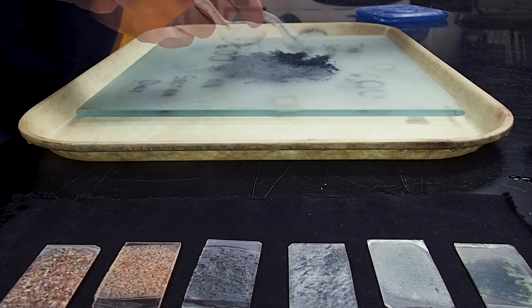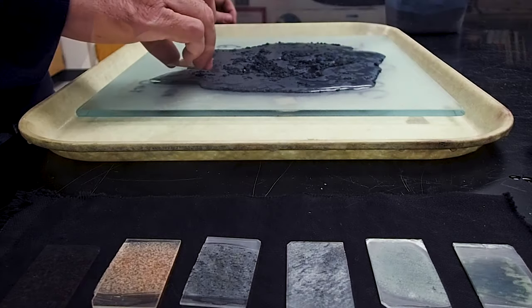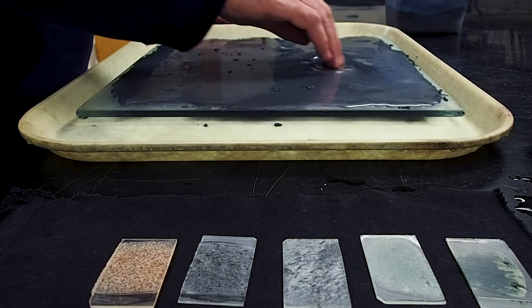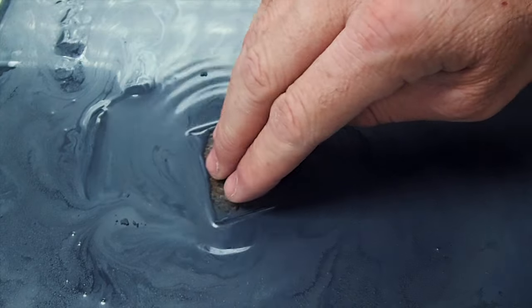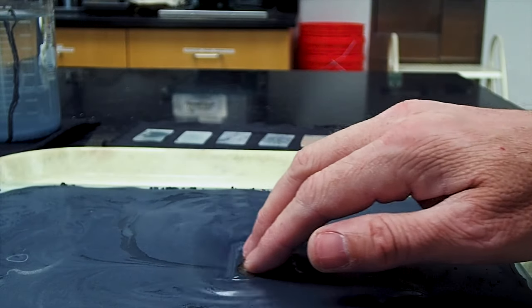Spread some 600 grit onto the glass plate and mix with water to create a slurry by working the slide around the plate in small circles. Do not press down hard on the slide, but rather do your best to maintain even pressure and focus on pushing the slide across the surface. Keep the sample flat and avoid rocking your hand back and forth at the wrist. Otherwise, you will end up with a tapered edge, thinner on the outside, and thicker in the center.